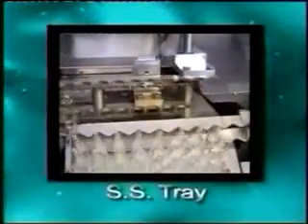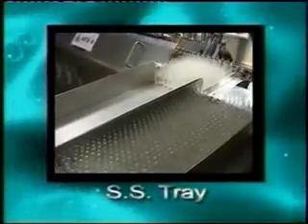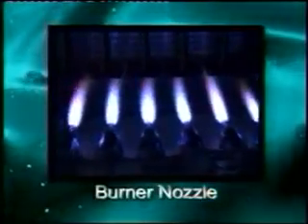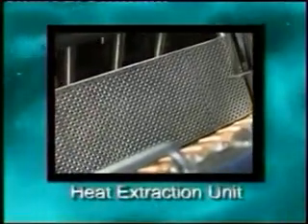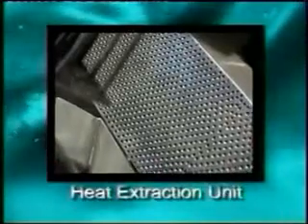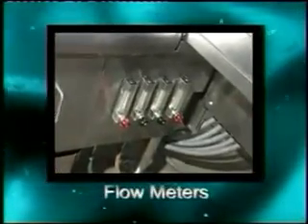Filled and sealed ampules are collected automatically on SS trays in an erect position. The burner nozzles are placed from the front side of the machine. Opposite the flame station is the heat extraction unit. Flow meters are provided to adjust the flame.